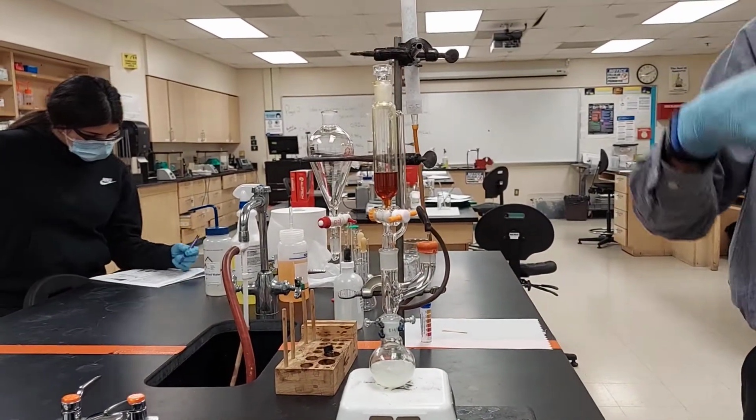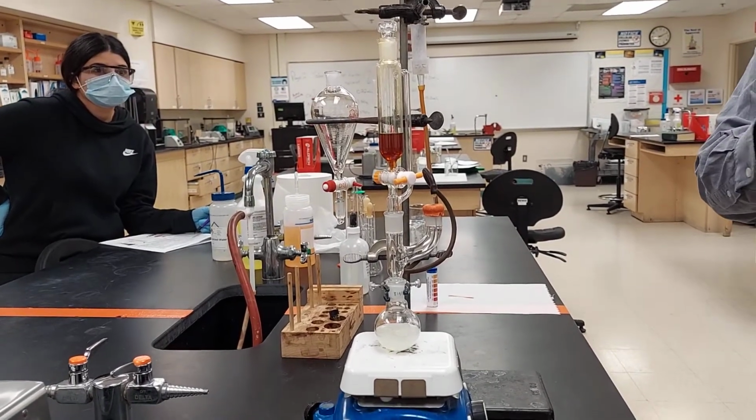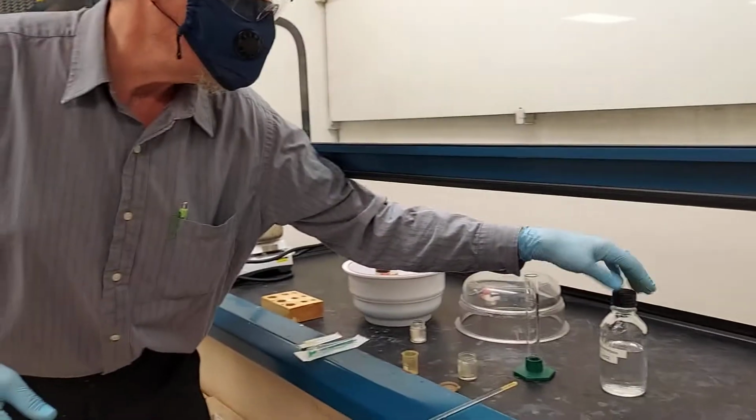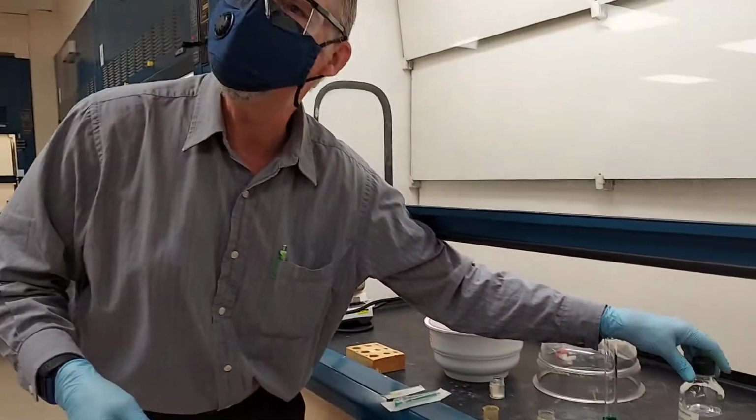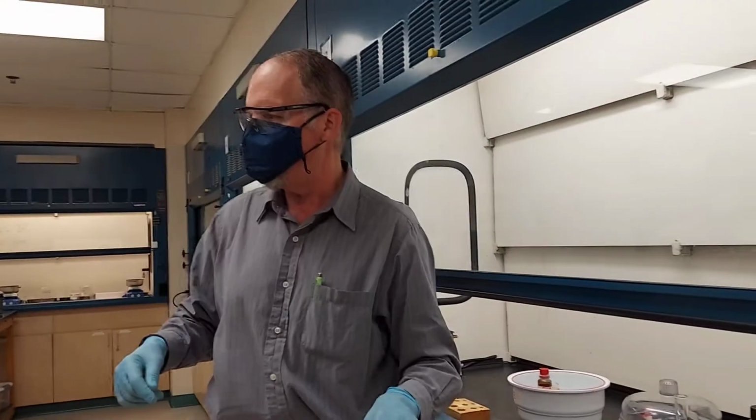He's just reading basically what we've done. We need to add acetyl chloride. Acetyl chloride, very dangerous chemical. We're dealing with two very dangerous chemicals today. In fact, I want to prove just how dangerous the aluminum chloride is before we add the acetyl chloride.